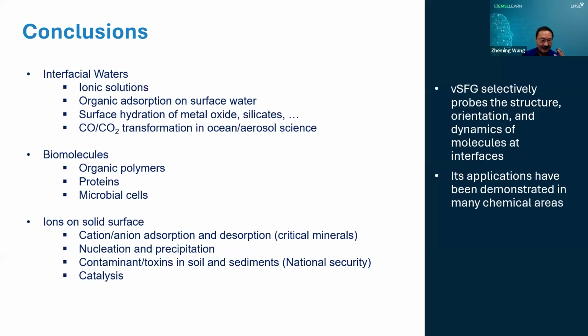And of course, as a conclusion, instead of giving specific conclusions, I just want to point out that VSFG can be used to probe all the stretch and bending vibrations, just like Raman and infrared, but specific for interfacial molecules. Wherever there are interfacial reactions, we may be able to contribute: atmospheric, power system, environmental system, energy system, battery studies, and so on.